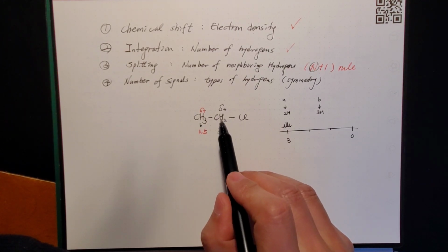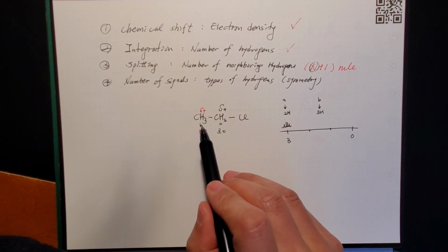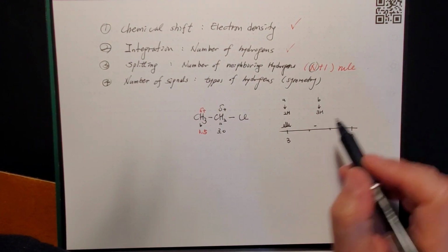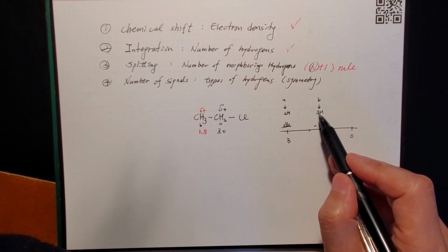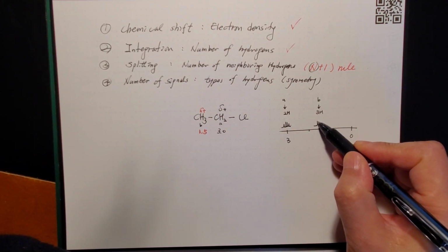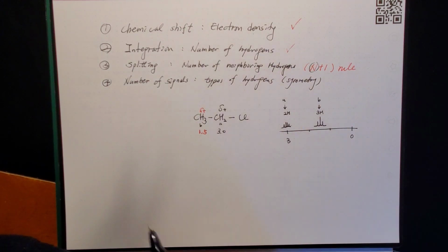When one is alpha and the other is beta, it's the middle of the 2 extremes, so the neighboring hydrogen feels different energy. So 2 of them cause 3 different energy levels for this neighbor. So this neighbor gets 3 lines, but those 3 lines should have the same split gaps, and also the area under the curve I'm trying to draw should correspond to 3 hydrogens, 50% more than this, so a little taller. My drawing is not really spaced out well, that has to be same as this.